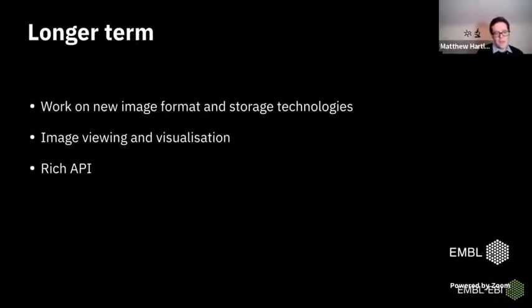Another thing that makes bioimaging more complicated than some other areas of science is that often you'll want to access one particular channel from a multi-channel image, or one time point from a time series, and the whole time series might be represented as one image. So you need access to subcomponents of the image, and new data formats provide a really good way to do that, particularly at scale. So we're working on how we integrate those into our existing infrastructure.